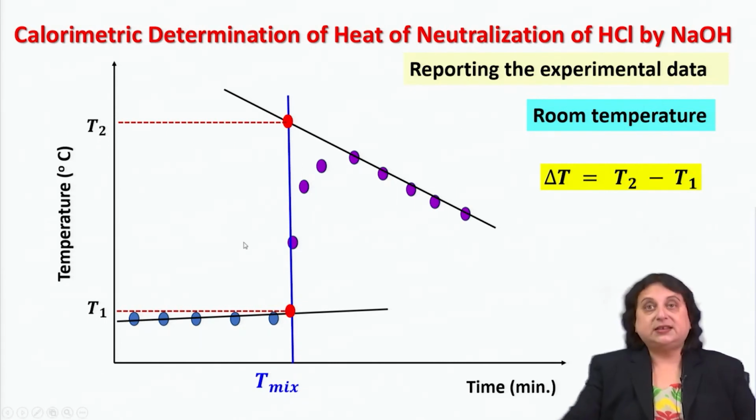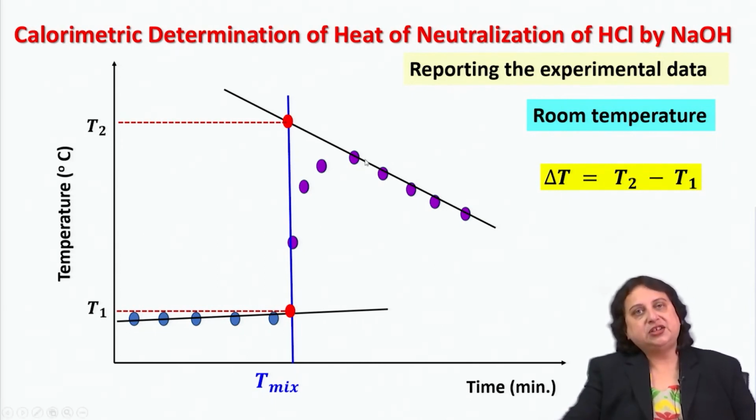So, there is still a temperature gradient, and I would still expect heat flow from inside the calorimeter to outside, but now the heat flow is going to be very slow because of the way we have fabricated the calorimeter, making it a very poor conductor of heat. Therefore, if I wait long enough, I will see that the temperature of the solution is slowly going down.